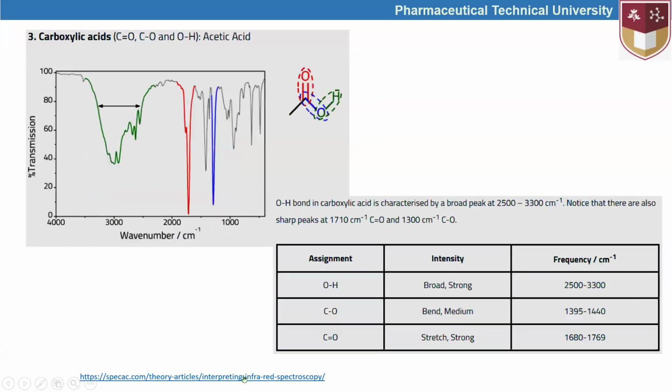Okay, and another one. Here we can see another example, the carboxylic acid group.